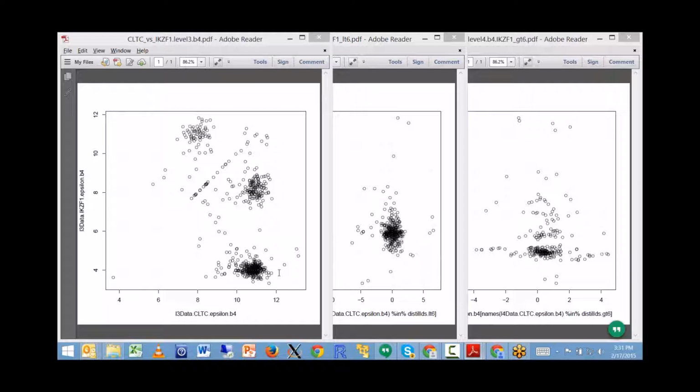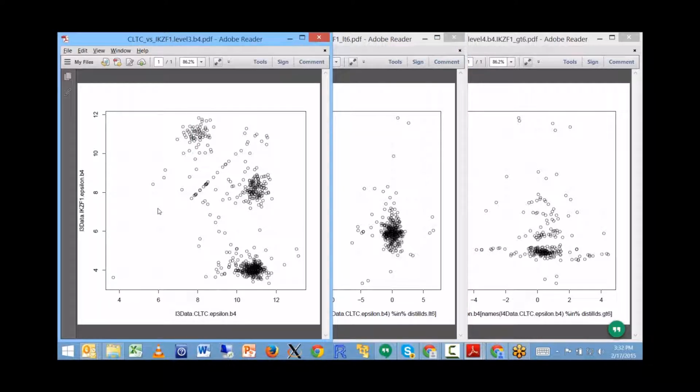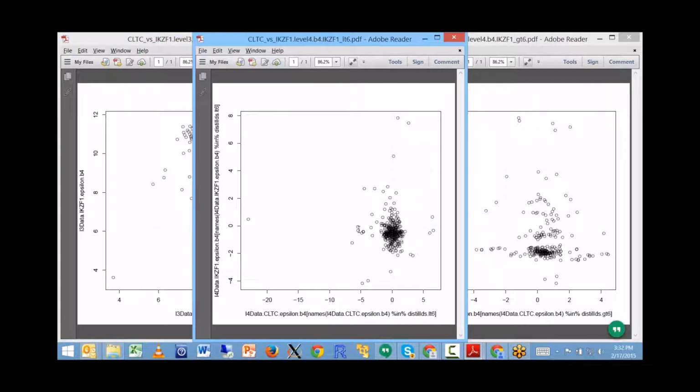So there are a couple of steps done there, so it's not simply subtracting the mean behavior per plate, but there are a few other steps. And so this is the cluster that corresponds to this cluster in level 4, right? So these are now these Z statistics in, oh, I'm sorry, that was level 3, this is level 4.